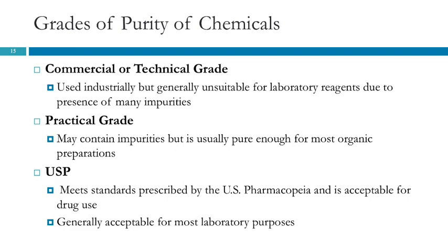So then another direction that I went from reading about all of this stuff, primary standards, right? There are all these different grades of chemicals. And I have been puzzled by this sometimes myself and had to go look something up. It's like, you guys need more methylene chloride or something. And it's like, well, you go back and there's like three different bottles and they're different kinds of methylene chloride. And it's important to use the right kind, right?